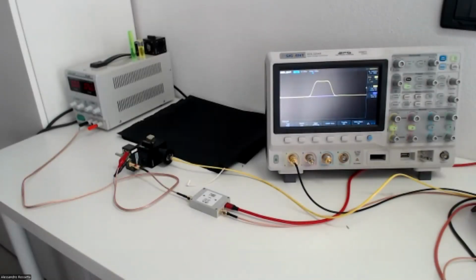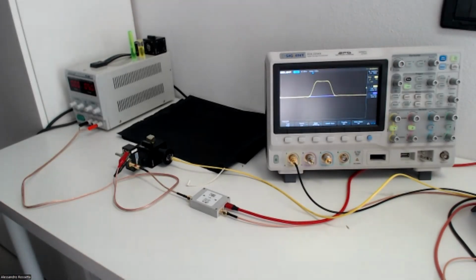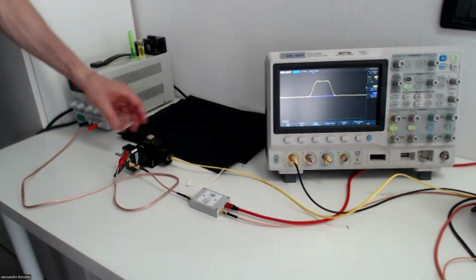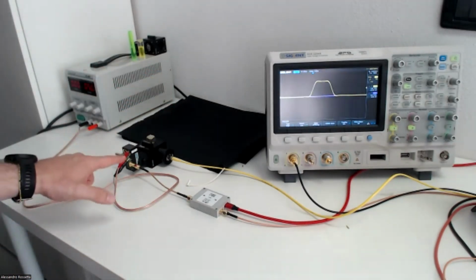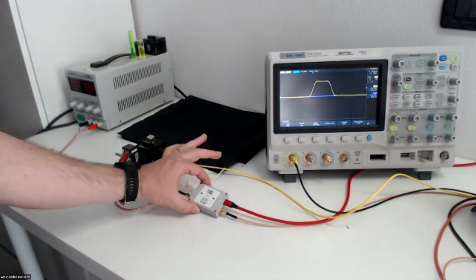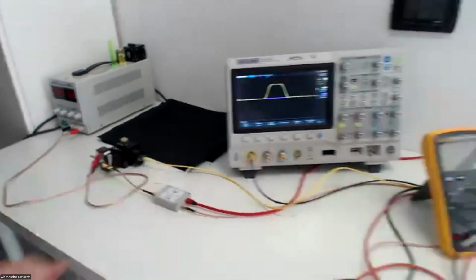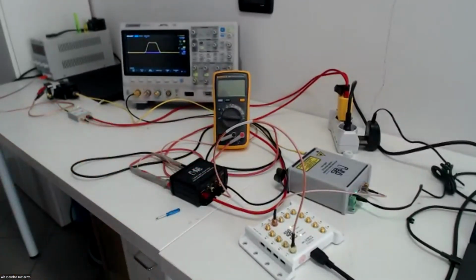I hope you can still hear me, but you can see our setup. So here we basically built a setup for this webinar. And here I am with Enrico, of whom you'll see only his hands. Enrico, you can show our viewers that we have a cuvette holder with a cuvette with some fluorescent material. Here we connected a photomultiplier tube, and then the photomultiplier tube is connected with an amplifier, our low noise amplifier. And then if we move, we can give you an overall view of the setup that we prepared for this live demonstration.